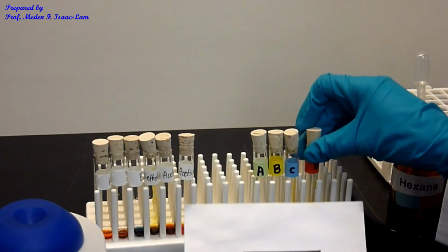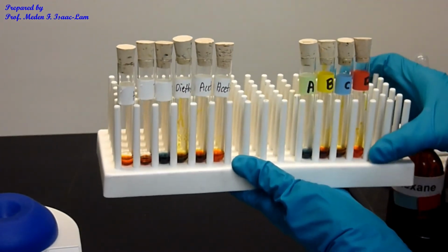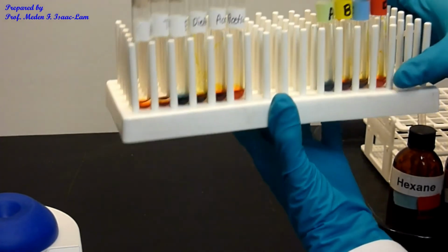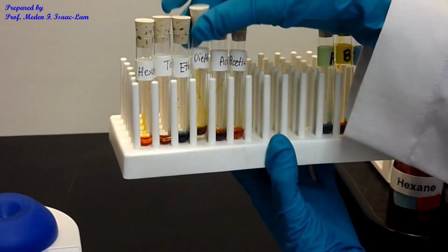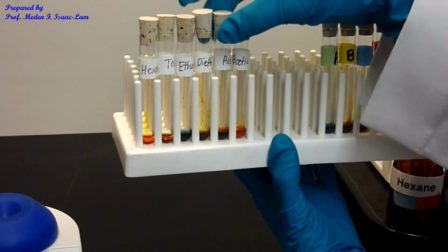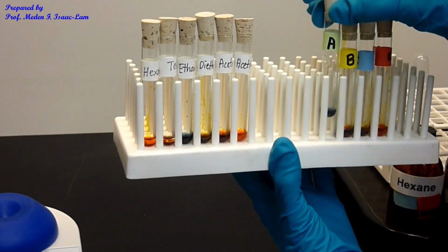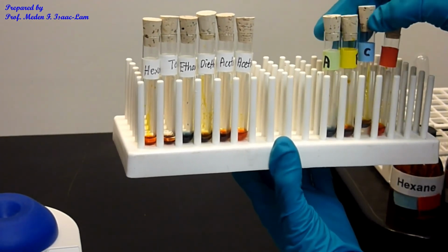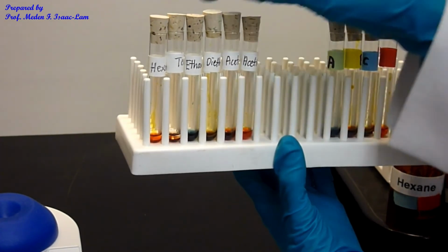Okay, so now you can compare. All right, so that's toluene. Toluene has a separation of layer. Toluene, ethanol, diethylamine, acetone, acetic acid, unknown A, B, C, and then D. So C has some kind of a reaction.